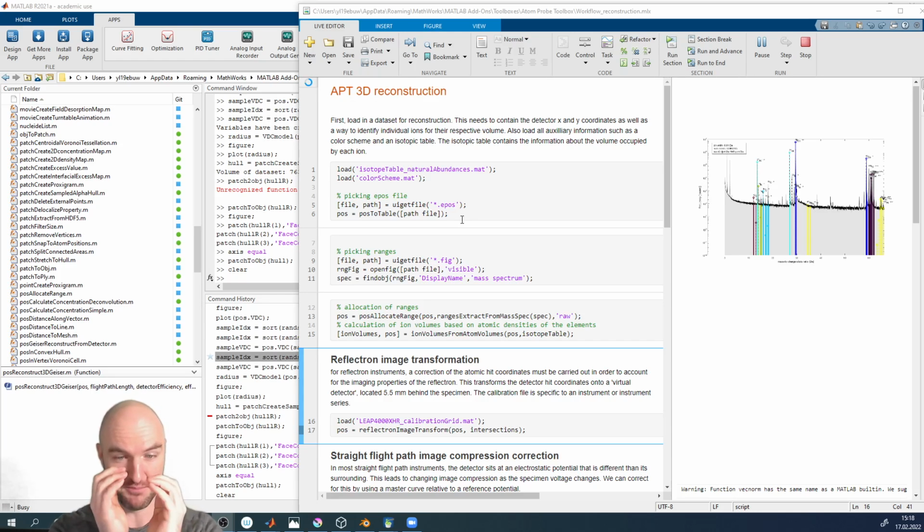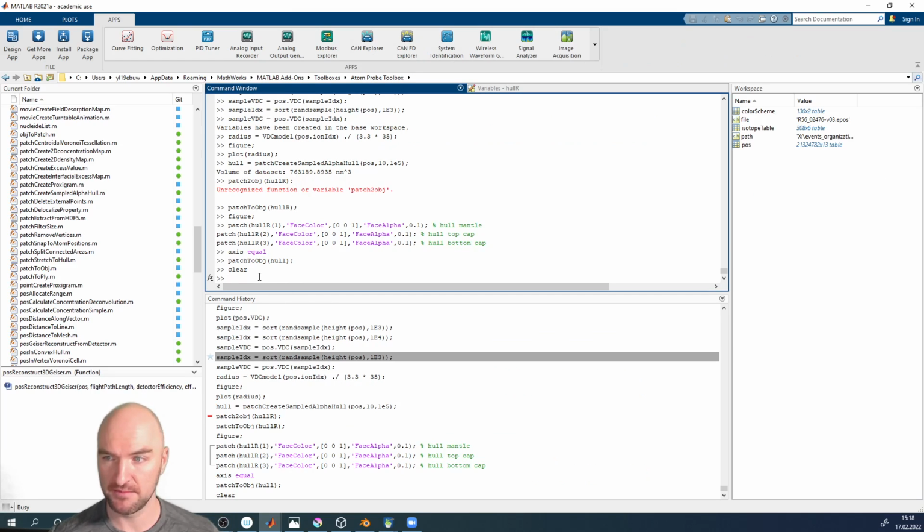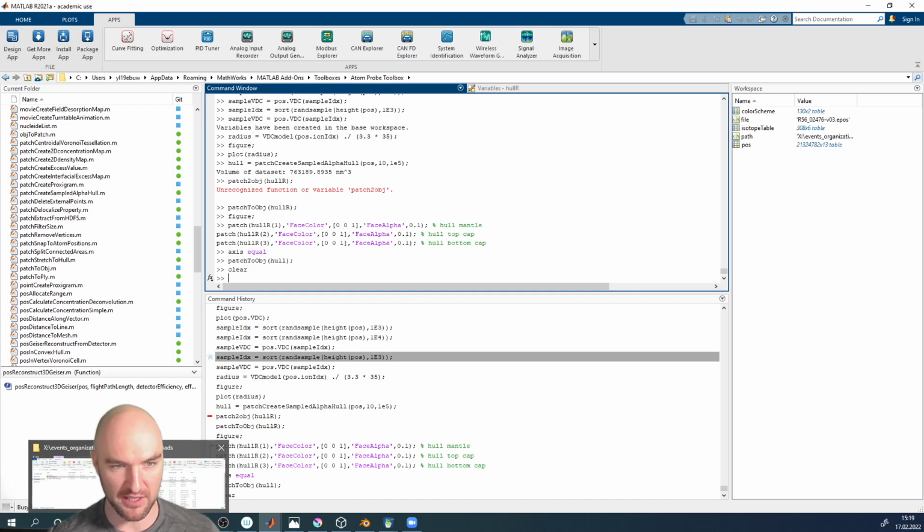They're usually either cubes or they're round. So you can say, okay, maybe I can fit a sphere to each of those objects and then drive the reconstruction until the sphere is matched as well as possible. I think this is just a good example to use. Tomorrow we're going to start modeling stuff, so we're going to use Blender a lot. But today, in an hour and a half, we're not going to have enough time to do modeling as well. So okay, let's get started.